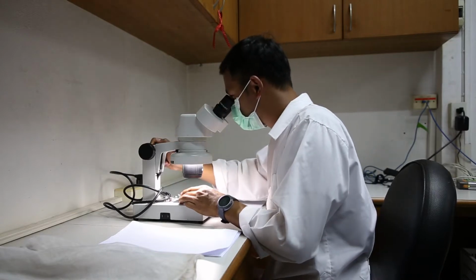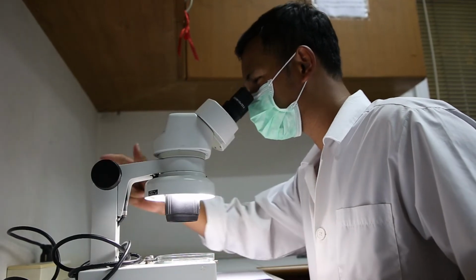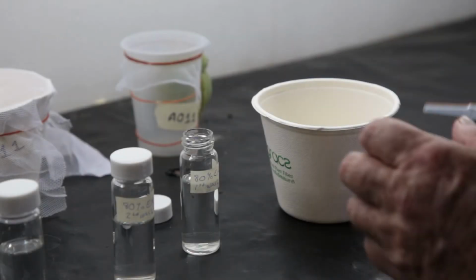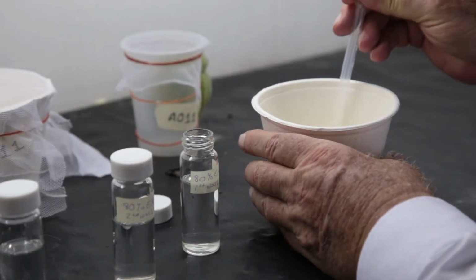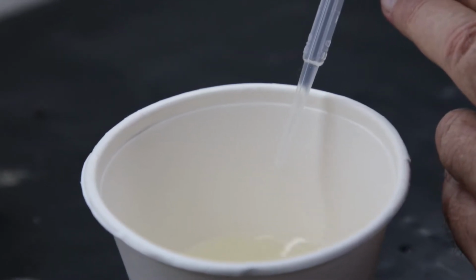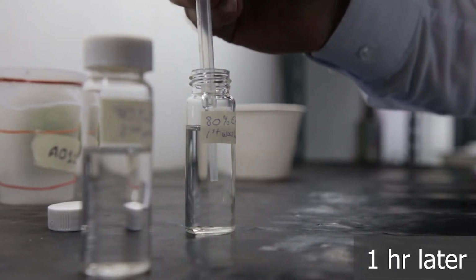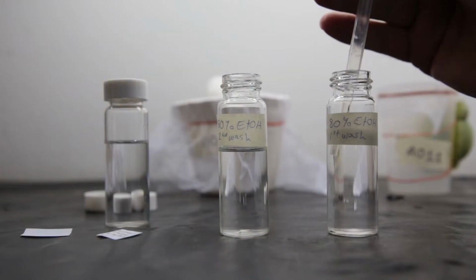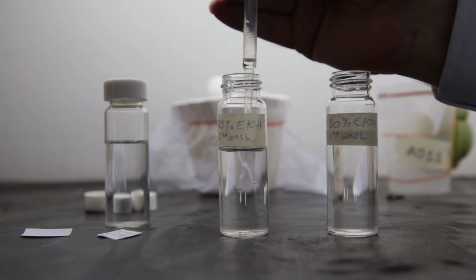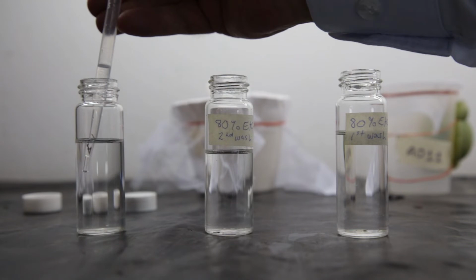If you decide not to rear the larvae through to adult stage, but preserve them for microscopic or PCR identification, then please proceed as follows. Using a pipette, transfer each larva into a bottle with 80% ethanol. Try to transfer as little water as possible as it dilutes the ethanol. Leave the specimens in the ethanol for an hour, then transfer the specimens to another bottle with fresh 80% ethanol. Then transfer once again to fresh 80% ethanol.